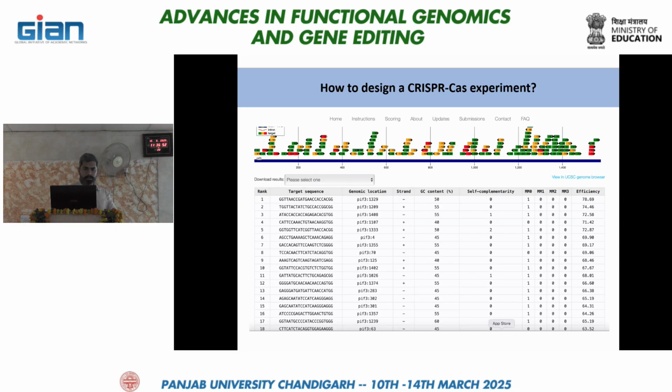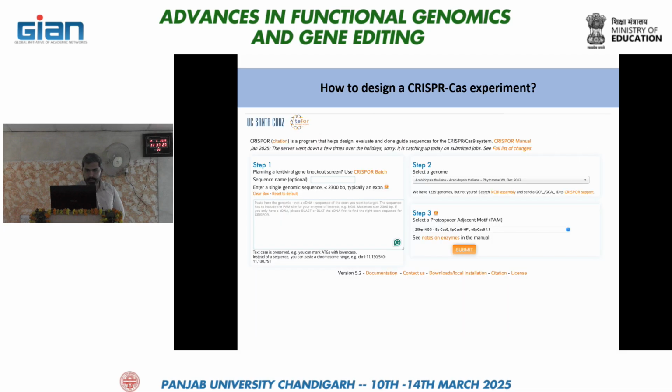Okay. So this was our result page and I have talked about the ranking according to the software. The first one should be the ideal target, but if we look at these aspects, like the MM0123 values, according to that, the rank fourth one should be the target according to me, and it also has a great efficiency of 71%. So that's about this CHOPCHOP tool, and after that we'll come to this tool.